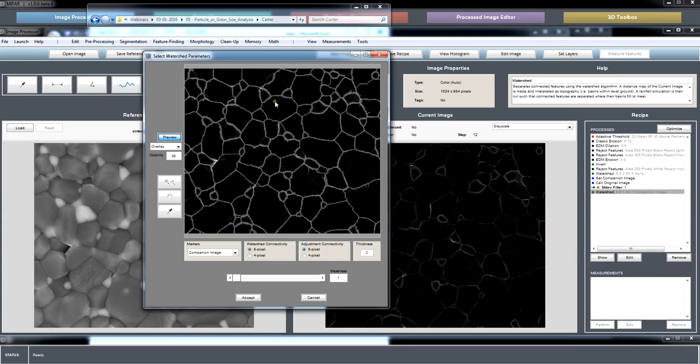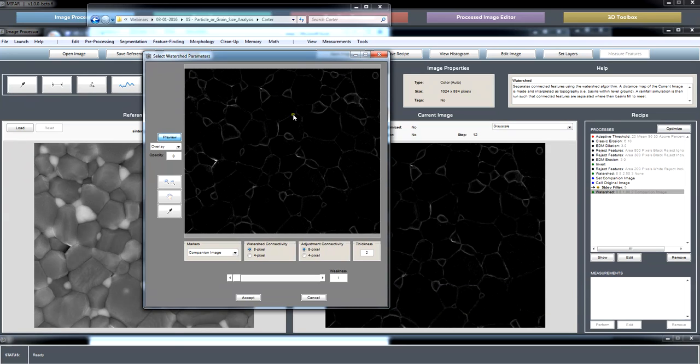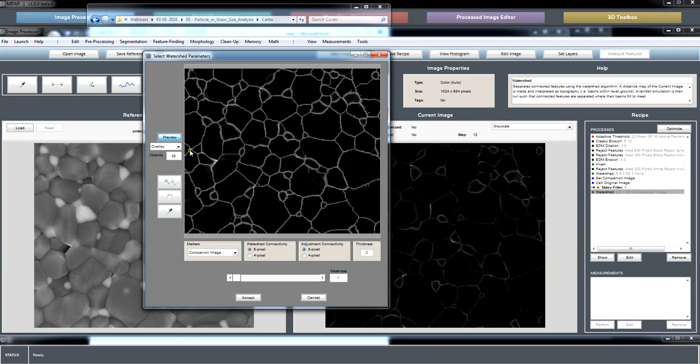What the markers do is they force all of the grayscale pixels that fall under each feature to be minima in the image, regardless of what their grayscale values are. So every pixel that falls inside of a marker gets forced to be part of a valley. So your peaks in the image are just going to be what's outside of the markers in between here.